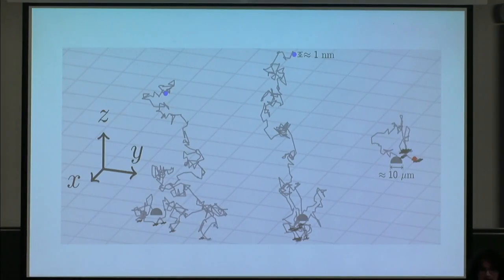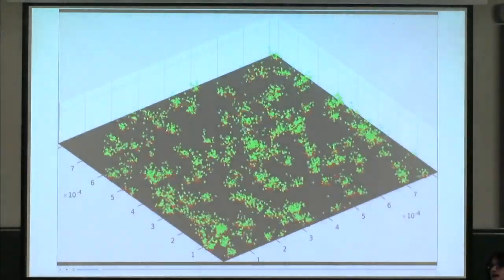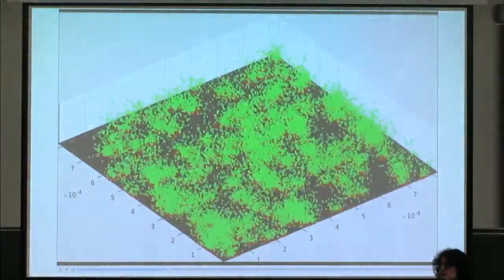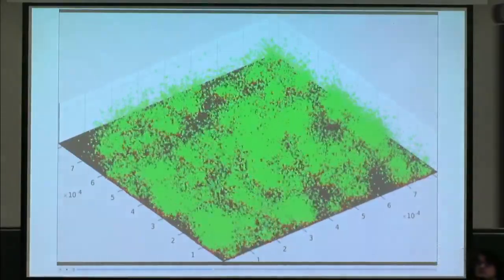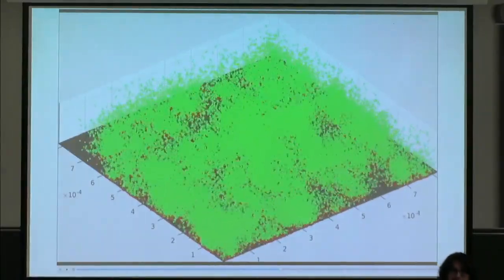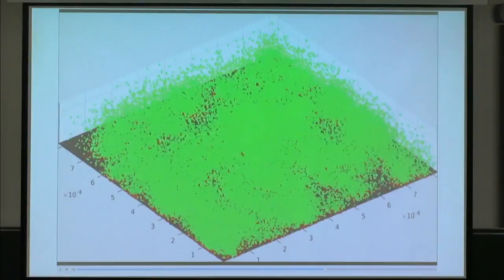So let's break a bit the simplicity of this drawing and go to a more realistic example. This is an approximated Monte Carlo simulation of just 1 second of one of these assays. These assays tend to last at least 24 hours. And when this video finishes, we're going to have the image if we did only 1 second and we're capable of detecting that few intensity of signal.